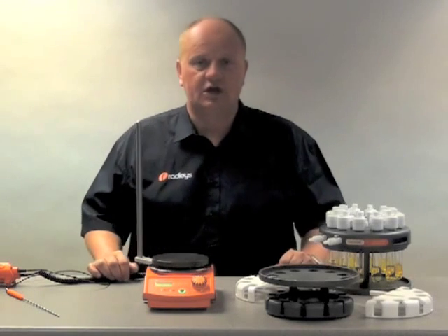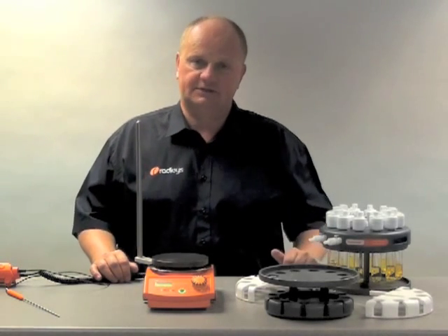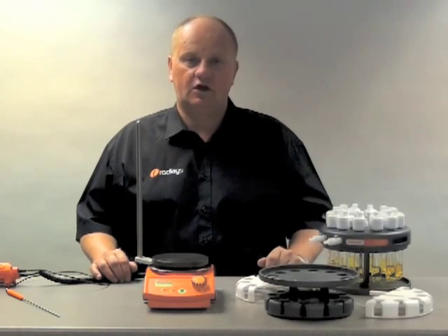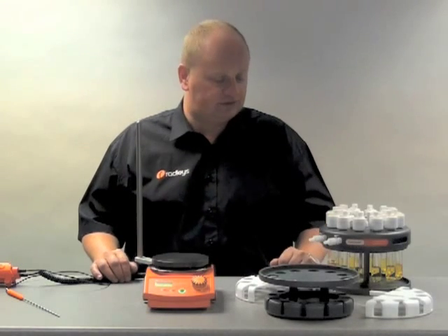Hi, my name is Mark Radley, I'm the Managing Director of Radleys and today I'd like to briefly show you the Carousel 12 Plus. The Carousel is a parallel synthesizer. It's designed to heat and stir reflux with inert gas, 12 tubes up to 20 ml simultaneously, thereby helping the productivity of your chemistry.